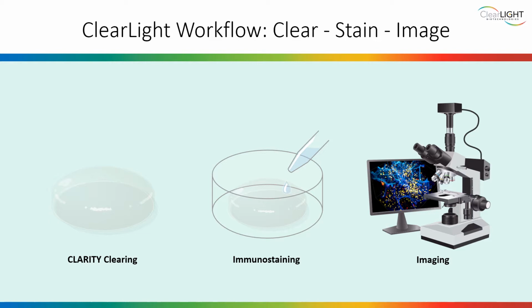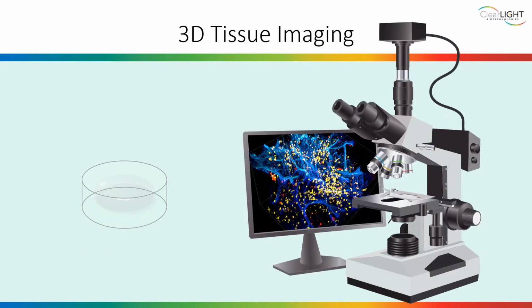This allows us to perform our digital spatial image analysis. Imaging antibodies in 3D reveals novel insights unobtainable with other technology. We use confocal microscopy with field of view imaging.